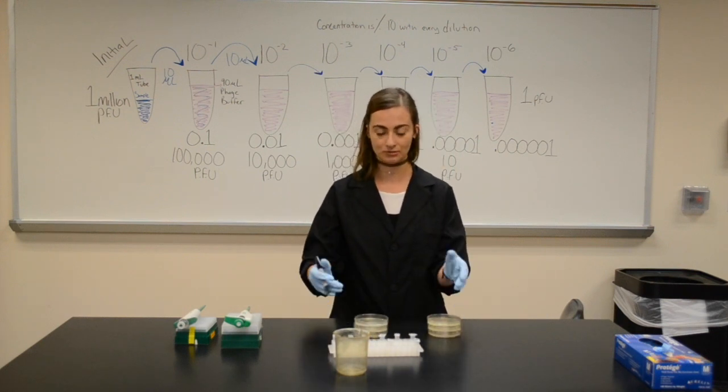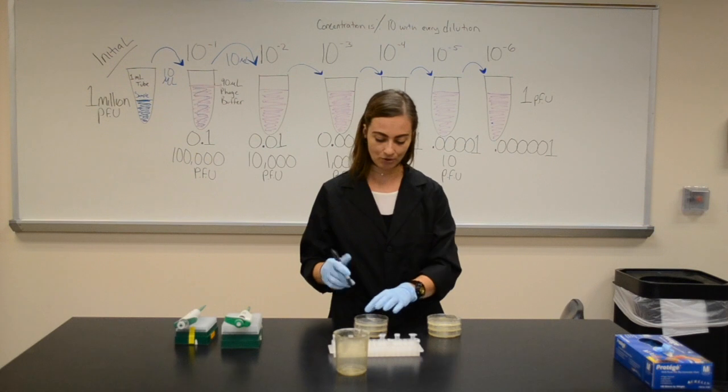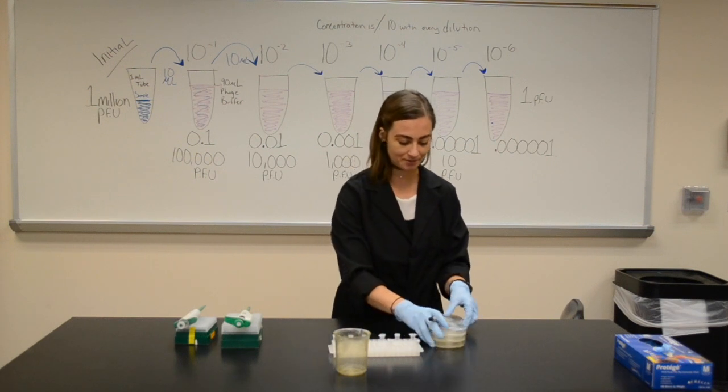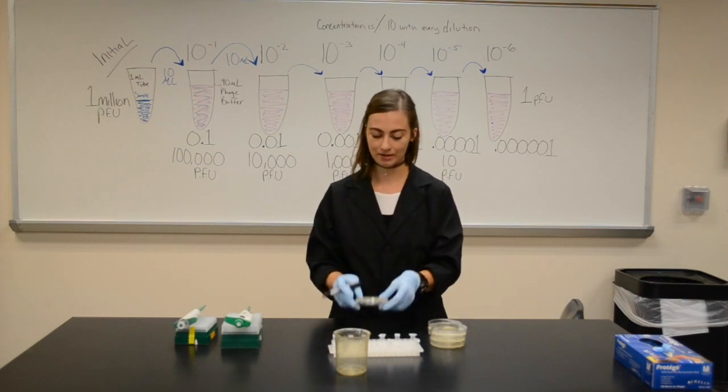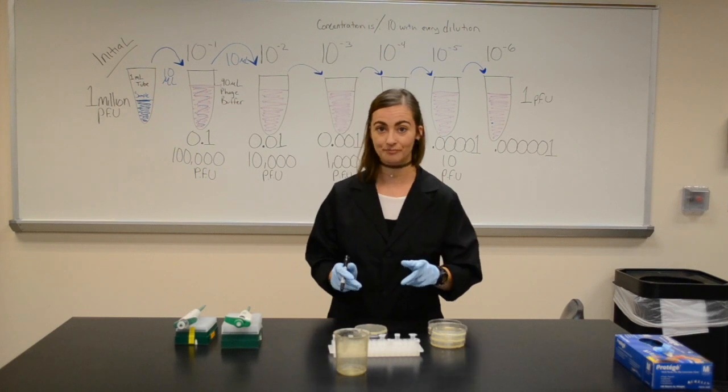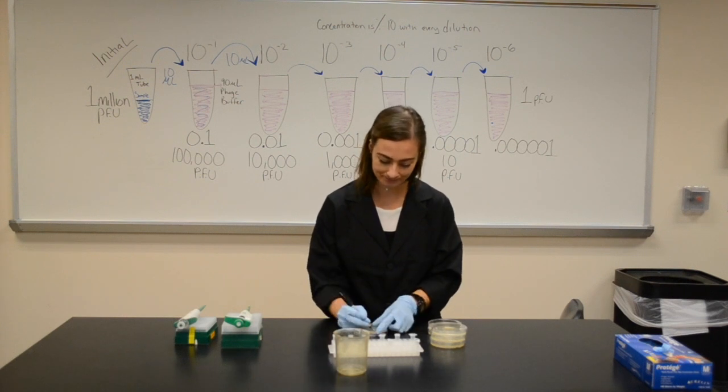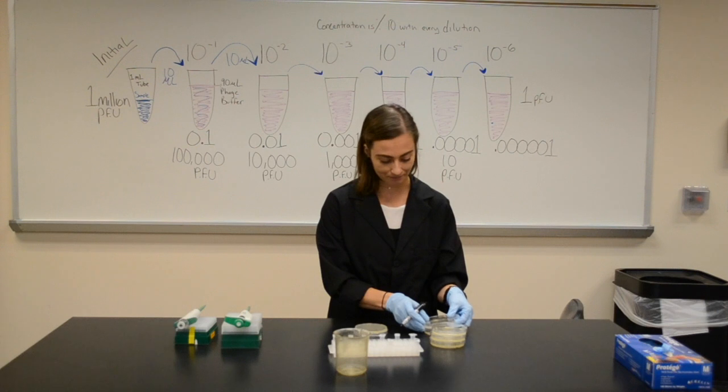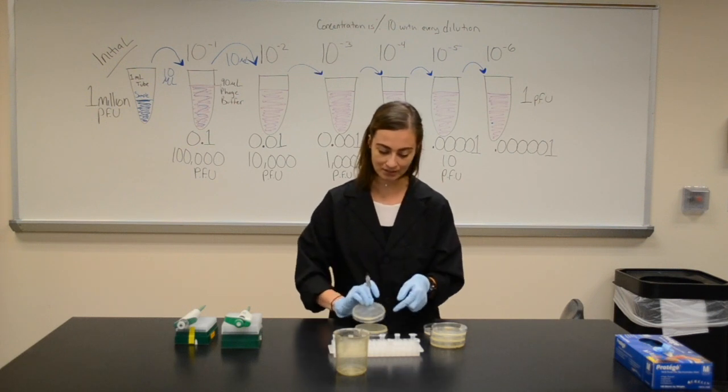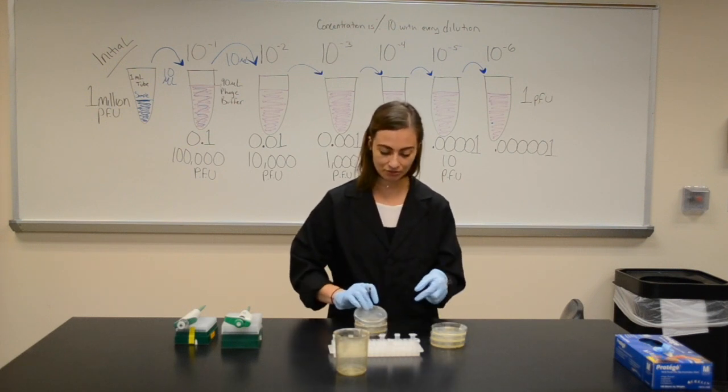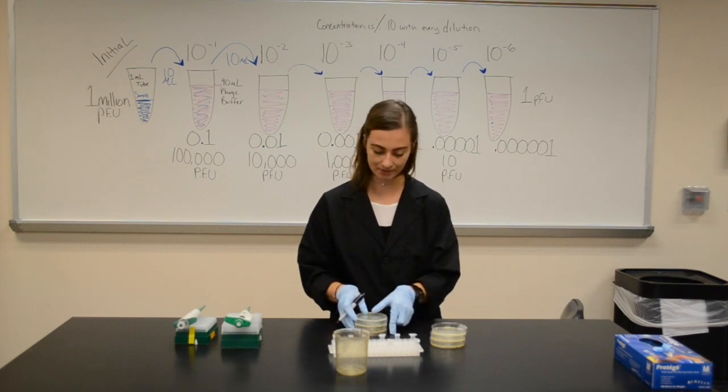I'm going to have six plates out for my dilutions since I'm doing six dilutions, and I'm going to label each of my plates. I'm going to label with my initials, with today's date, and with what dilution it is. So I have 10 to the minus 1 with my name and the date, 10 to the minus 2, 10 to minus 3, minus 4, 5, and 6.